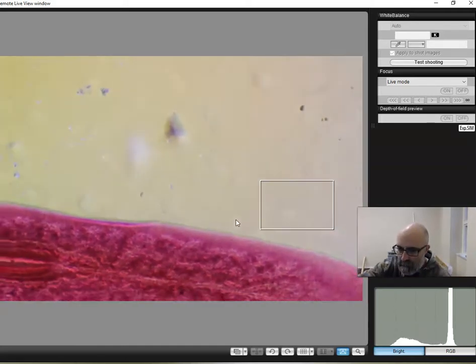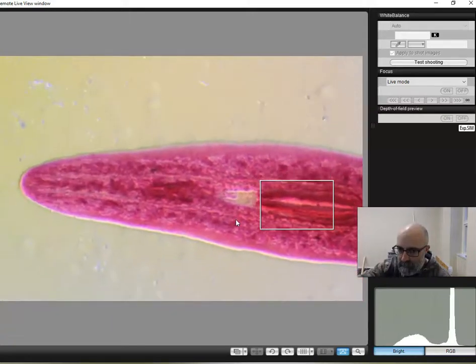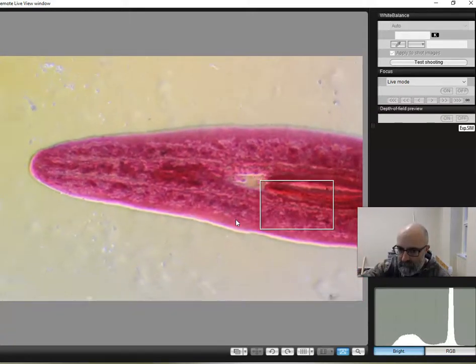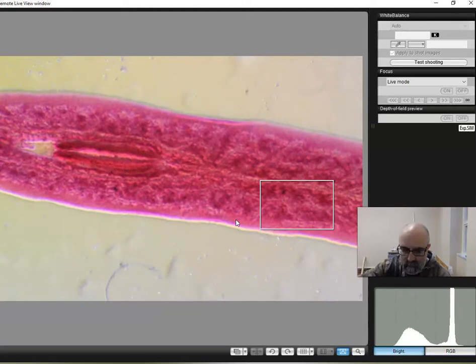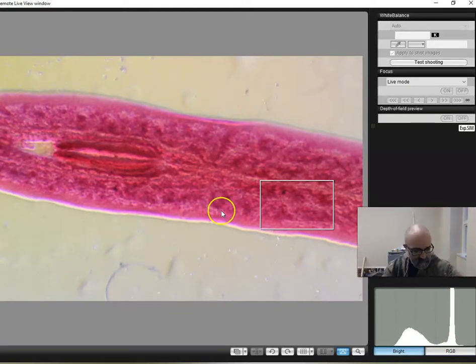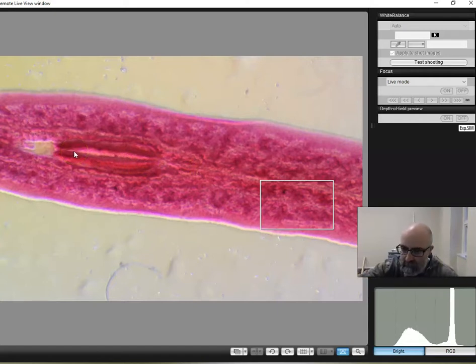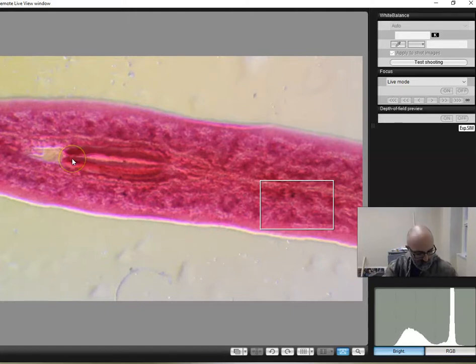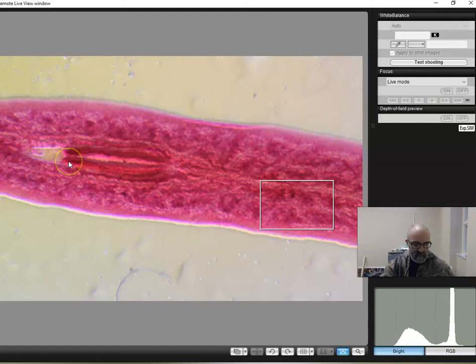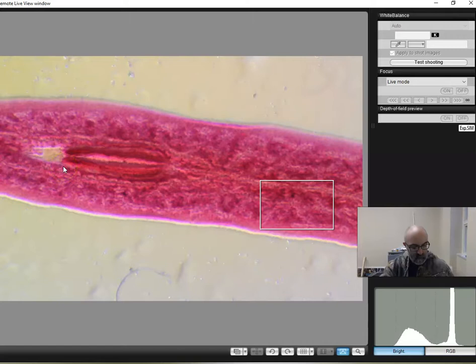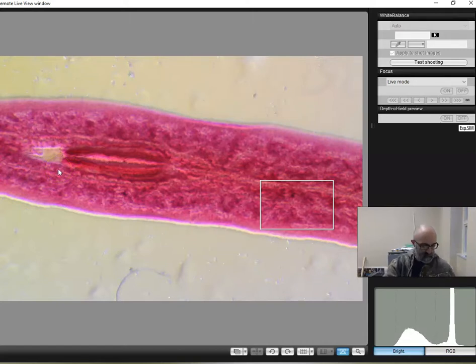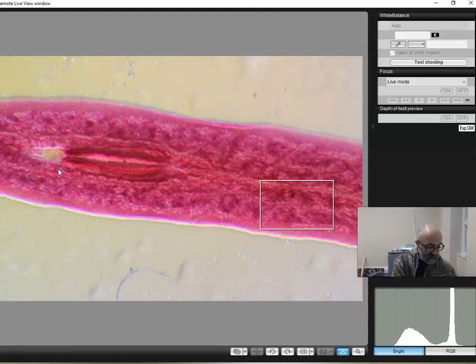And then we move backwards. That's the rest of the body. That's the back end. So the other things on here to know is the pharynx, which is this structure here in the middle of the organism. It is sort of like the mouth. They don't have a mouth in that they don't have a complete digestive system. They don't have an in and an out. The in is the out. They have one opening that is involved with ingesting and excreting both.